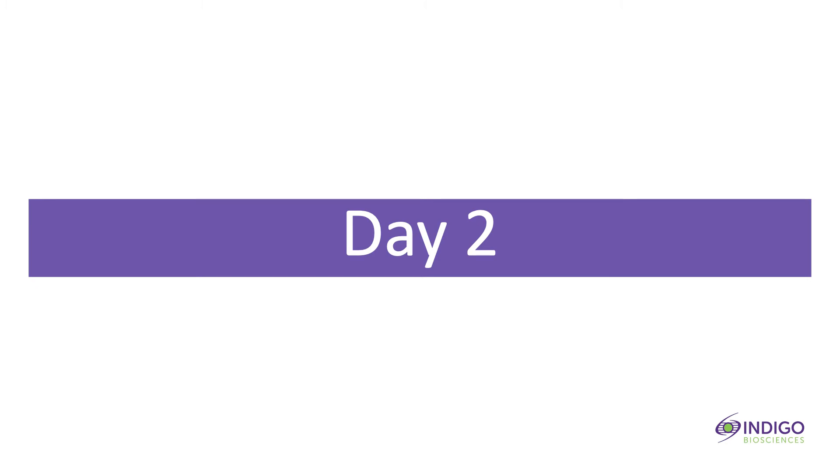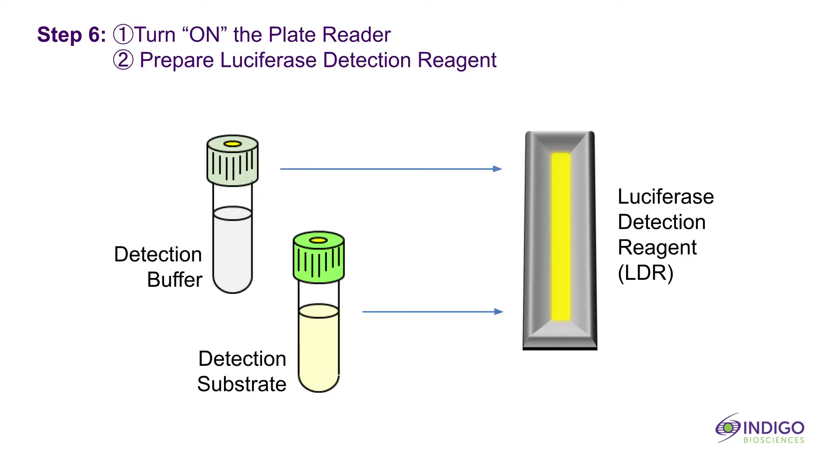It is now Day 2. Today's manipulations do not require special regard for aseptic techniques and therefore may be performed on a benchtop. Approximately 30 minutes before intending to quantify receptor activity, remove detection substrate and detection buffer from the refrigerator and place them in a low-light area so that they may equilibrate to room temperature. Turn on the plate reader and set it to luminescence mode. Program the instrument to perform a preliminary 5-second plate shake before reading the first assay well. Program the read time to 500 milliseconds per well. After the tubes of detection buffer and detection substrate have equilibrated to room temperature, combine them to generate luciferase detection reagent. It is most convenient to perform this step directly in the media basin. Gently rock the basin several times to mix the solution, then set it aside for later use.